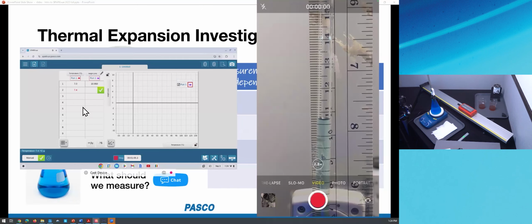So we can see the temperature is beginning to rise here, and it looks like the water level's actually fallen a little bit, so I'll give it a moment to get a little bit warmer. Sometimes the jostling around will cause the water levels to change a little bit. But if you ever want to correct something, you can go back up to a data point and click on its cell, and you can correct it. So now I see the water level looks like it's approaching 11.00. I'm going to wait until it is 11.00 and press the keep button and fix that.